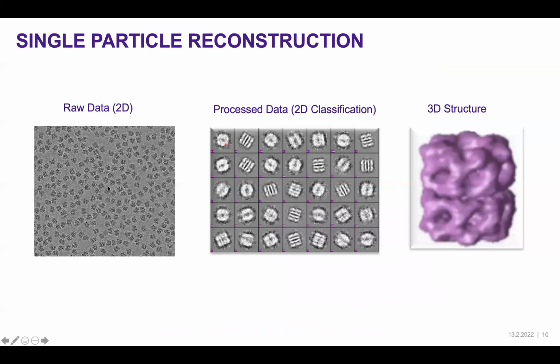It involves sample preparation, specimen preparation, acquiring raw data, processing the data, classifying and image processing, and then 3-dimensional structure determination. The advantage here is that you need a very little sample. There is no need to crystallize, and the entire process happens directly. You can extract the biological sample, or even synthetic nanoparticles or embedded nanoparticles if they are atomically precise, and you need only a few microliters. For crystallization, you need a large number of samples, and importantly, many of the particles do not crystallize.